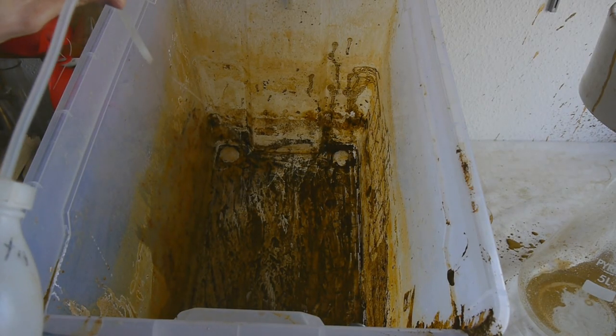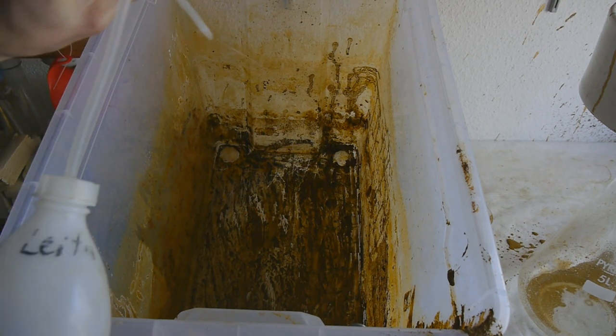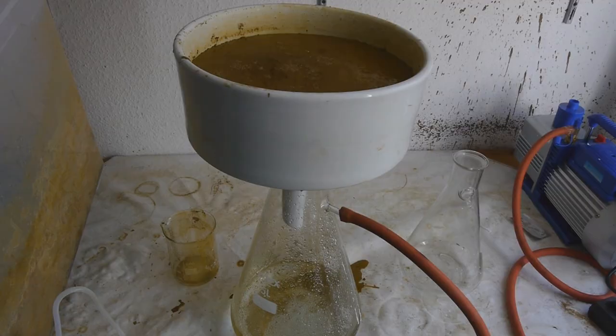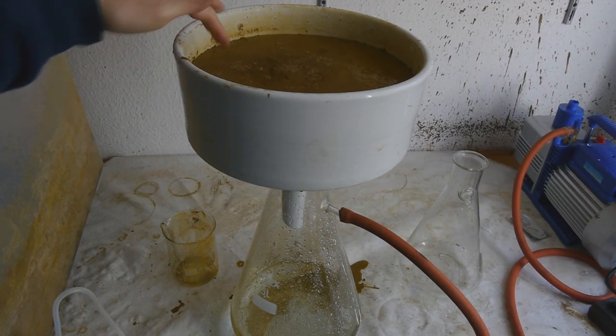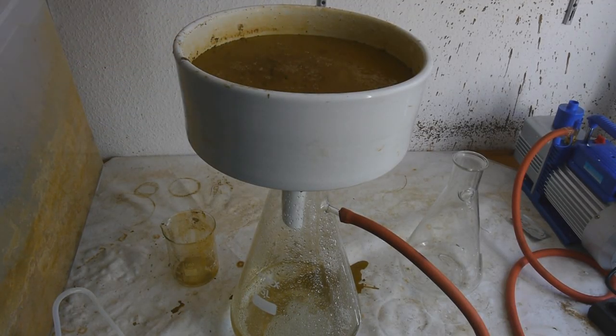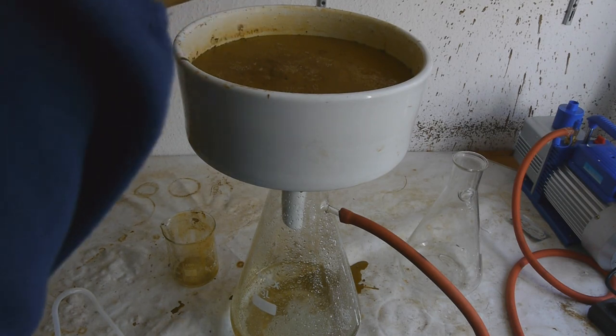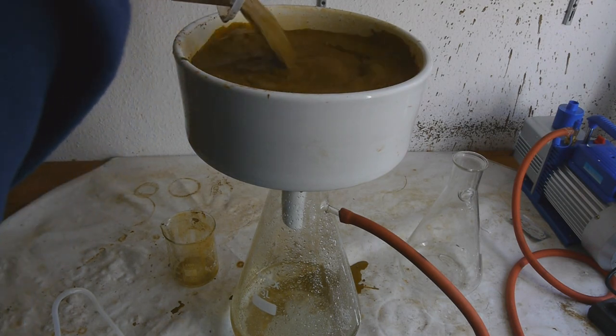Now I'm just flushing down the little rest of iron oxide with some tap water. This is finally getting somewhere, but you can see there's already sodium sulfate crystallizing out on the top of this iron oxide, so we need to wash that down. So let's start by using the water that we used to flush out the big box.